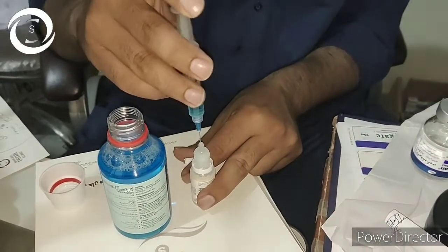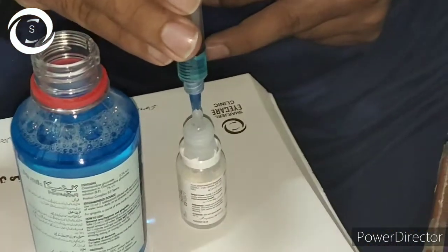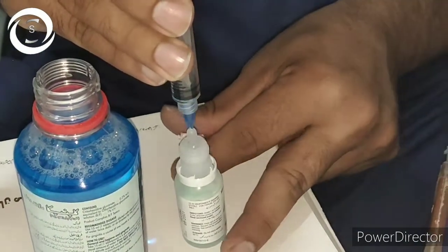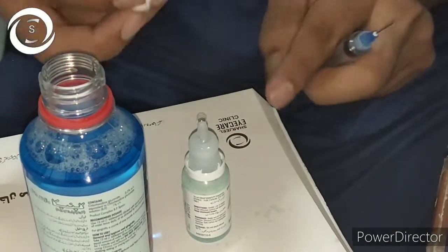When you prepare it, make sure you refrigerate it and use it within 3 to 5 days, then discard the remaining and make a fresh one. The dosage is one hourly, though it also depends upon the aggressiveness of the disease.